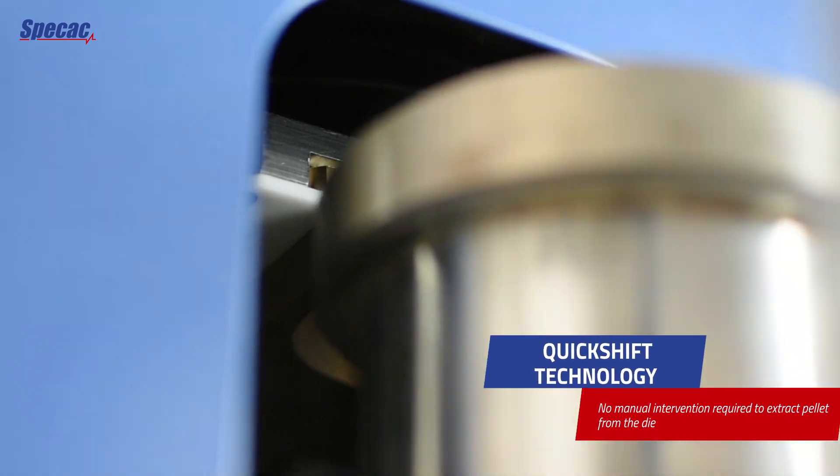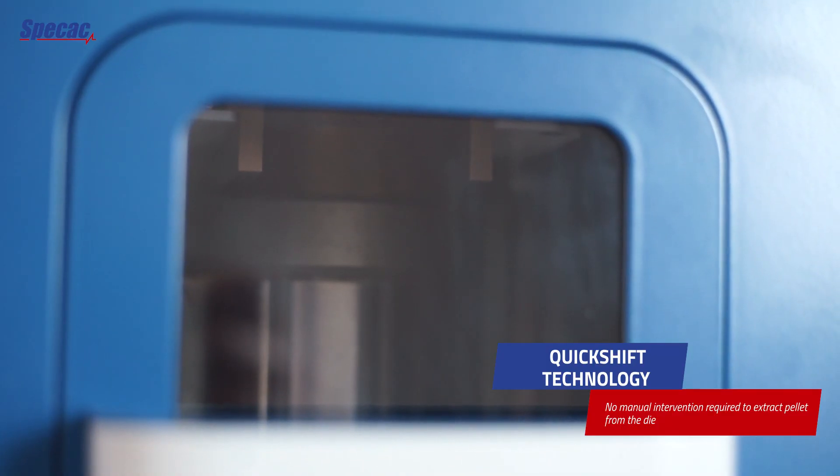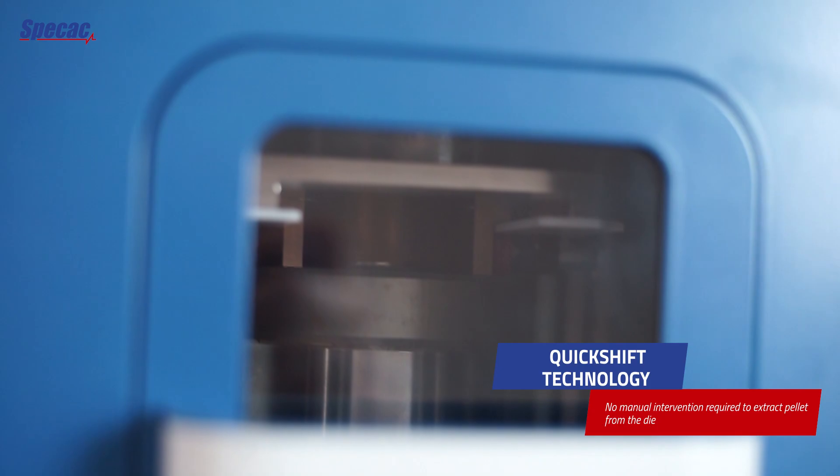The APEX 400 press is equipped with quick shift technology, which automatically shifts the pressure plate between its load and release positions, meaning that no manual intervention is required to extract the pellet from the die.